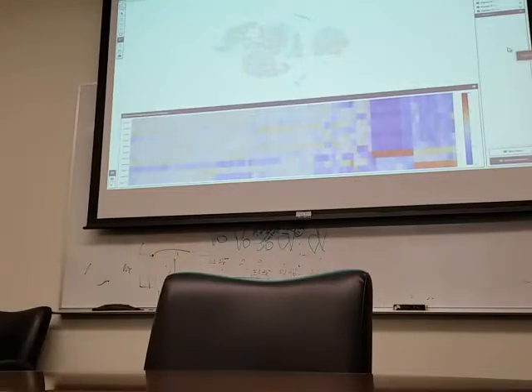We could throw the cells out and re-analyze, but nobody seems to be able to do that. Chris, can you do that view where you highlight the particular genes and search for CD14? Yeah, that was one of the two clusters, also in cluster 9.